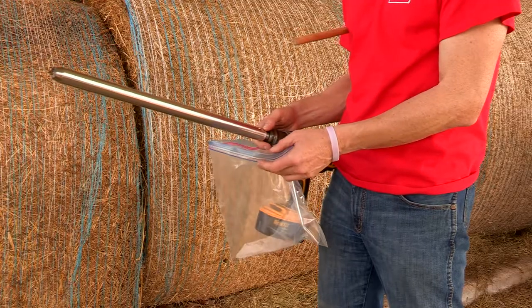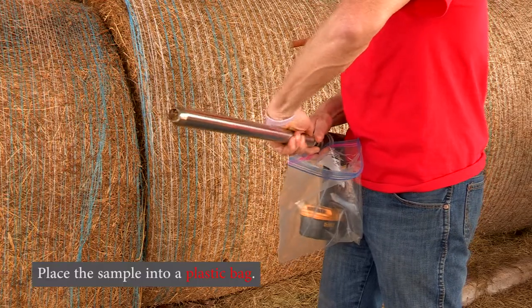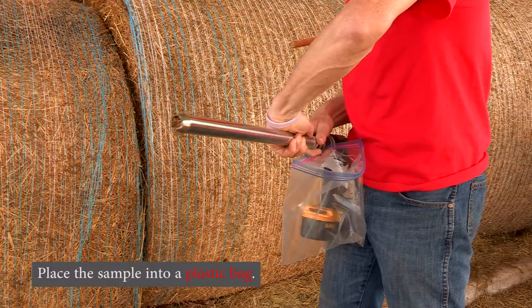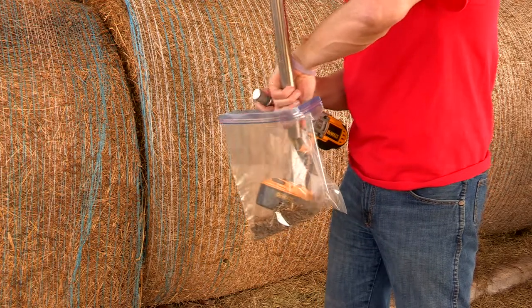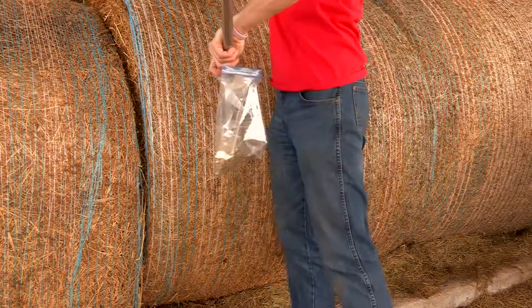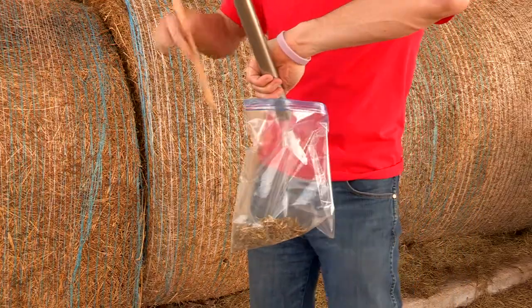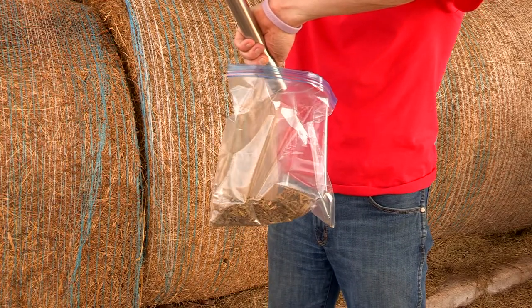Once you take that core out of the bale, open up the sampler and put the sampled hay into a bag. You can set aside the drill and use the plunger from the other side to move all that hay into the bag.